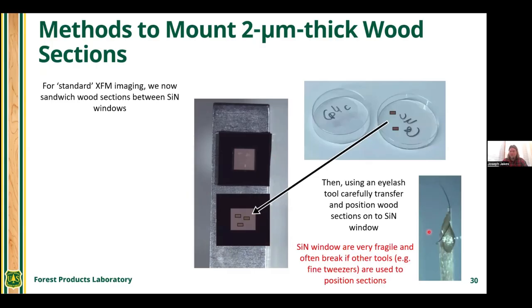And then you carefully use an eyelash tool to transfer your sections from your plastic petri dish onto the silicon nitride window. In my experience, using anything besides an eyelash tool to manipulate or move these sections causes that silicon nitride window to break.